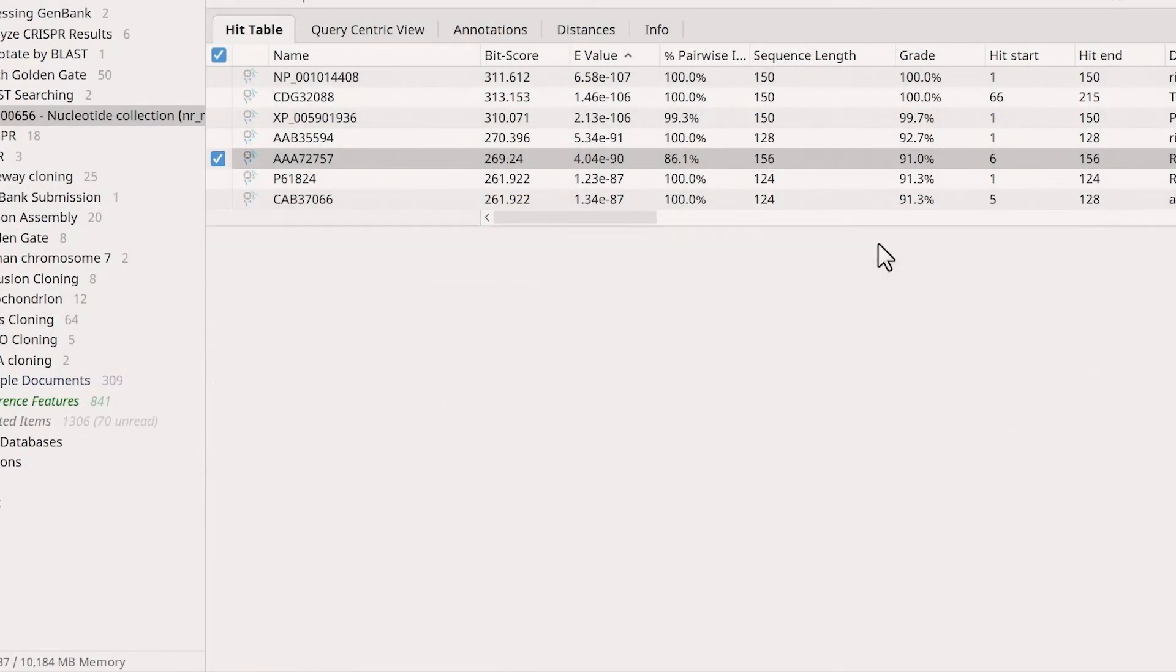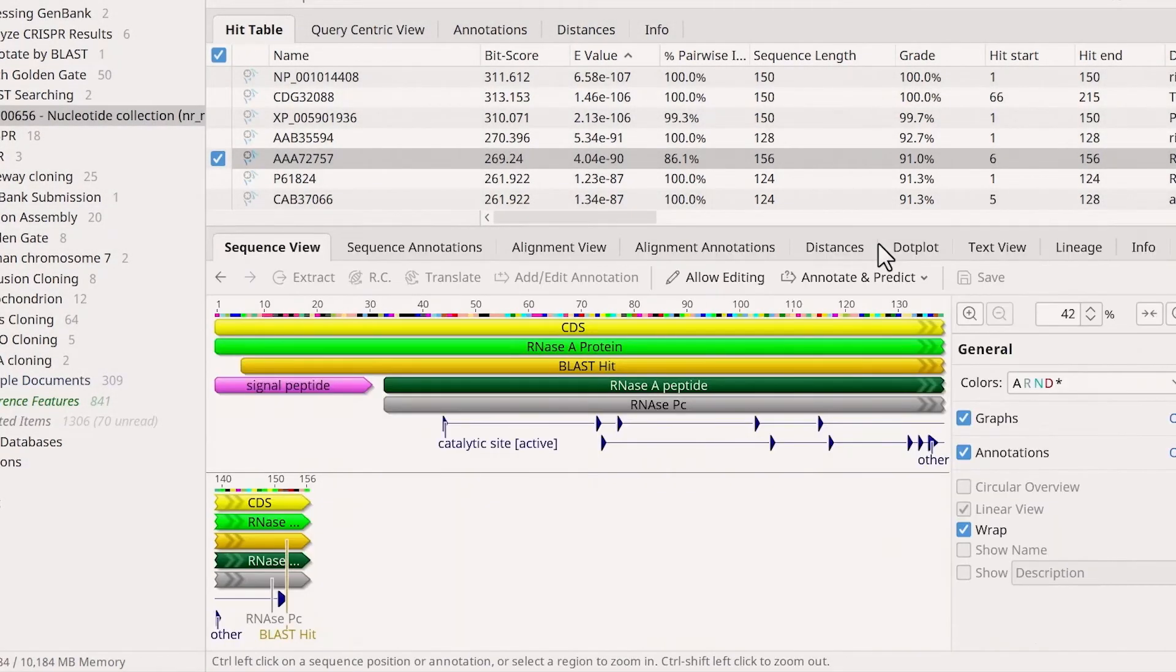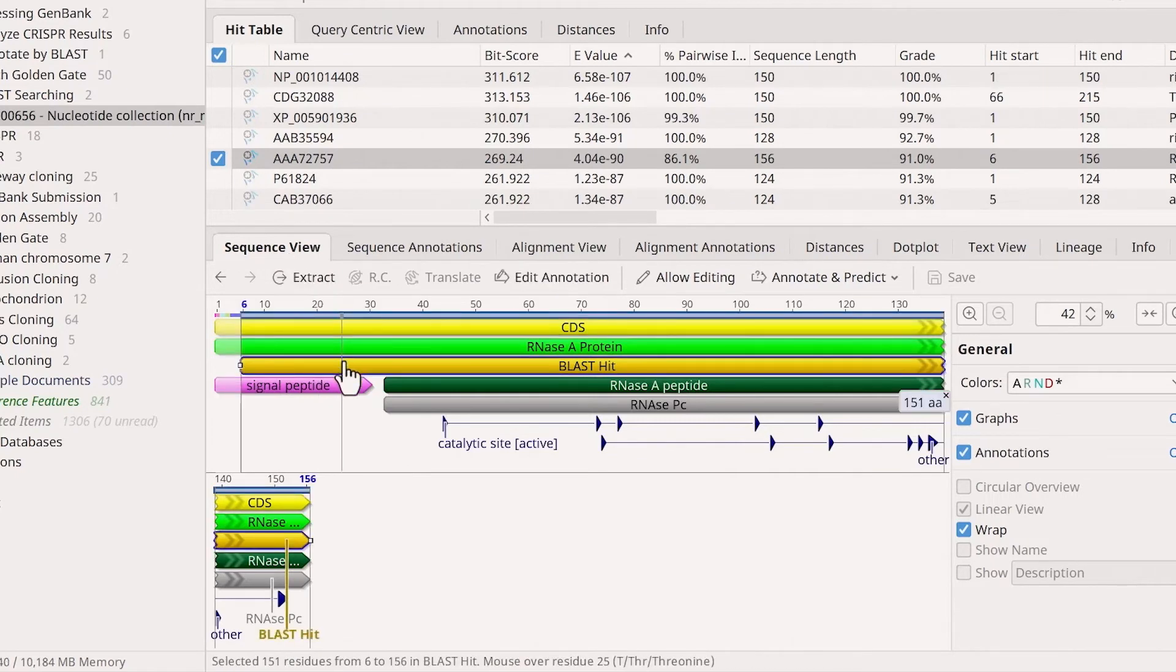Once downloaded, Genius will add a new sequence view tab to the entry, which includes a BLAST hit annotation.